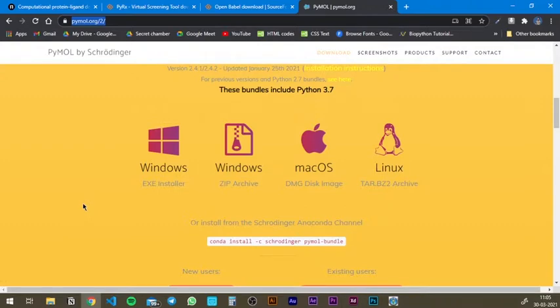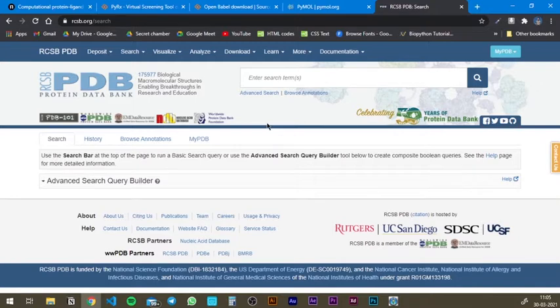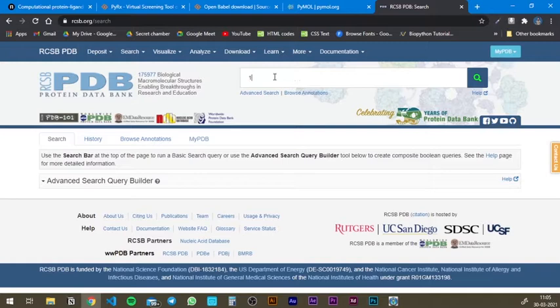After you install all the softwares, you need to download the structure of the protein and the ligand that you need to dock. Let's go to RCSB, that is the protein databank site. Over here you can basically download the sequences and three-dimensional structures of various protein entries. The structure I'm going to download has the protein databank ID 1RO5. This is a specific ID for a specific protein — you can also write the name of the protein to search and get results.